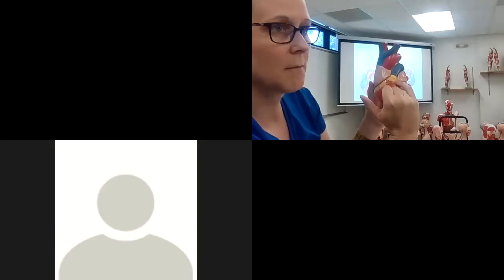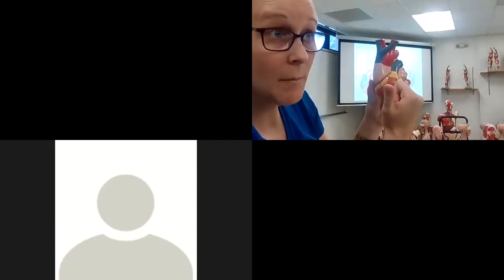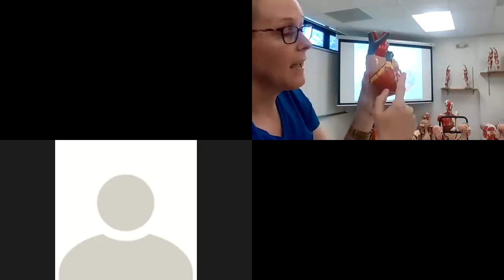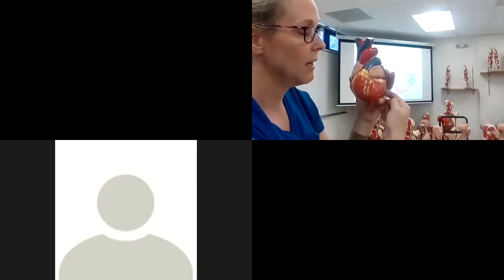The left immediately forks, and you end up with the anatomically named anterior interventricular coronary artery, because it goes in the anterior interventricular coronary sulcus. The fork that goes this way in the left side coronary sulcus will be our circumflex, because it's going to twirl around.